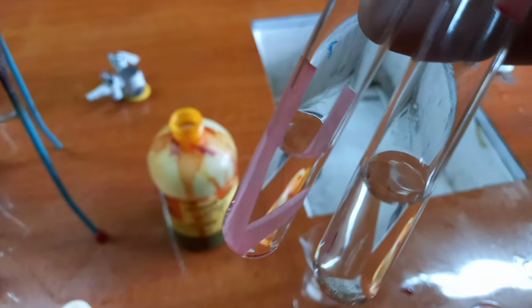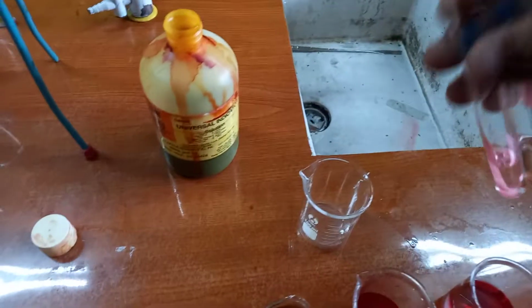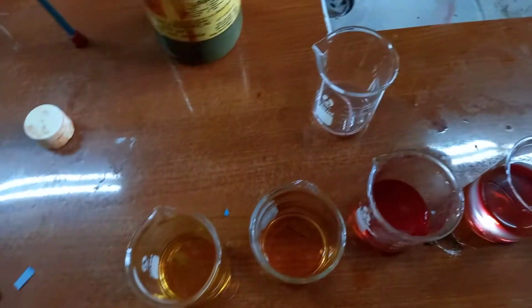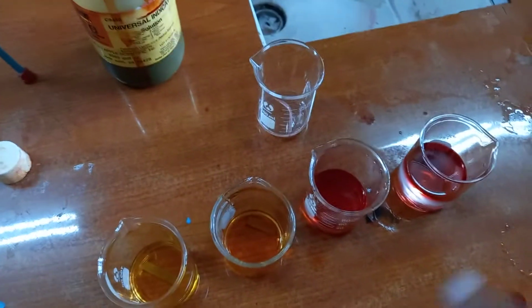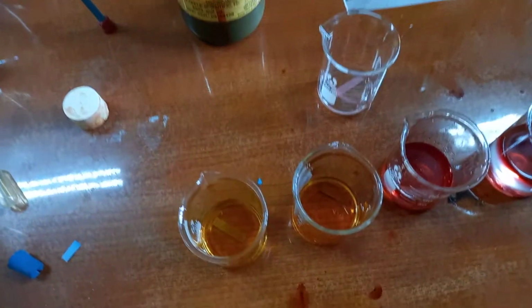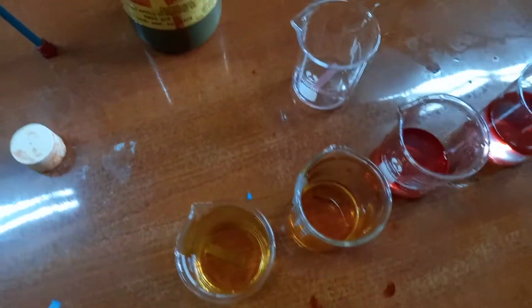Now these are the samples of the aldehydes that we prepared and oxidized with the potassium permanganate in the test tube. So I'm pouring them out, and we're going to do the same thing as we did with these compounds. I had paused the video and did not realize that I didn't press it back to start.